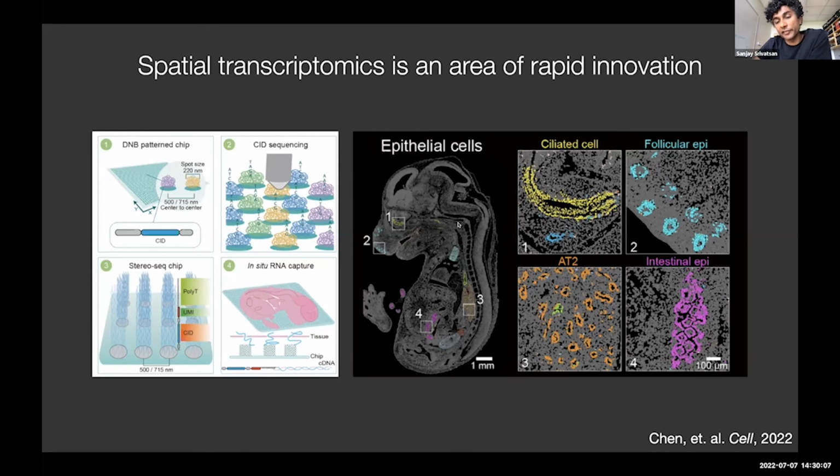On the right, you're looking at a figure from their paper. Now, instead of the lower resolution that I was showing you earlier, you have a much higher resolution where you can actually segment the cells from the image that you've taken and overlap them with these nanoballs that are within each of them.